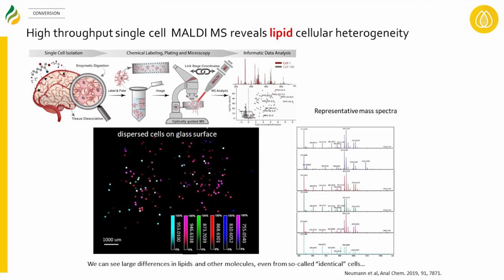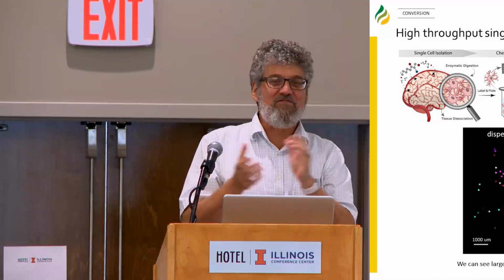What we can do then is if you scatter cells, you get individual cells, and you get a lipid profile in every individual cell or every individual location. And this works surprisingly well, and again, not counting sample preparation, it's about a second or so per sample. Now again, that's the acquisition. If I hand you a terabyte of information on thousands or hundreds of thousands of cells, it can take a month or more to go through the data set.